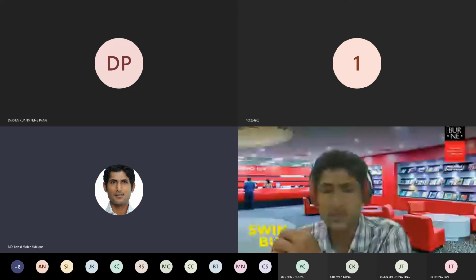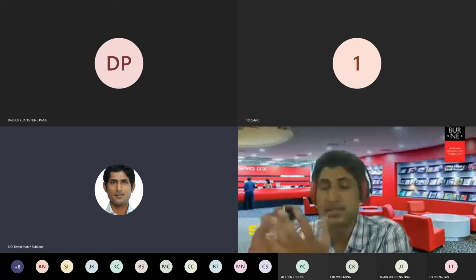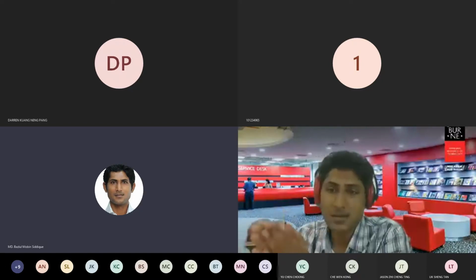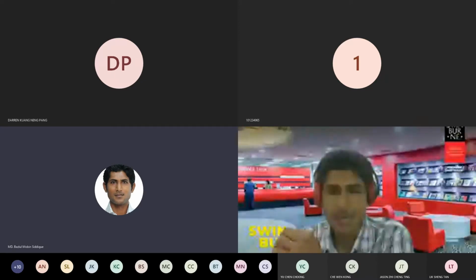But coming to the end, the titration is done. For the titration, we need to use a chemical indicator. When the chemical indicator changes its color, it can go to colorful, or from color to colorless, or it can be different colors. So when the chemical indicator changes its color, we know that the titration has been finished already. Okay, so after the titration is done, how much of the acid or base did I use in that titrant, right? How do I know it? So there is some calculation associated.